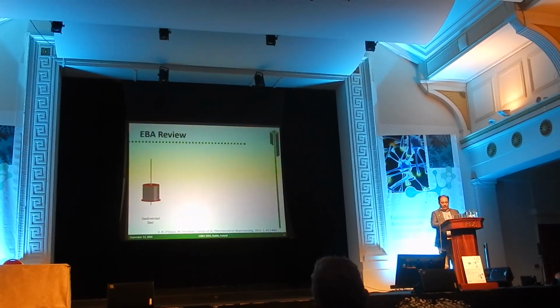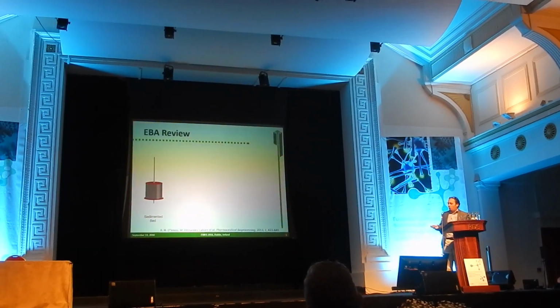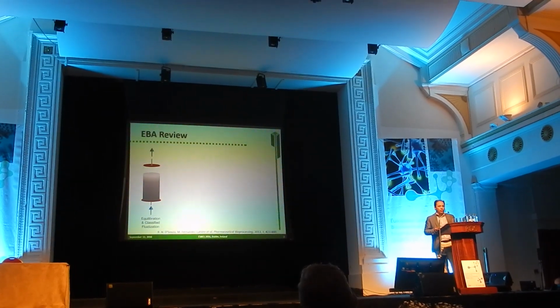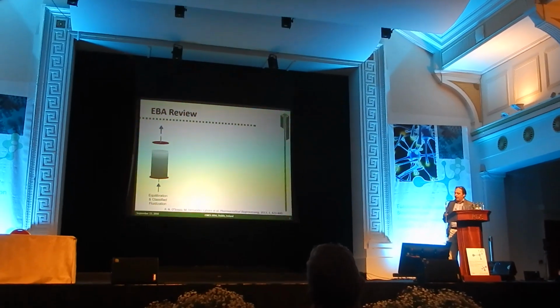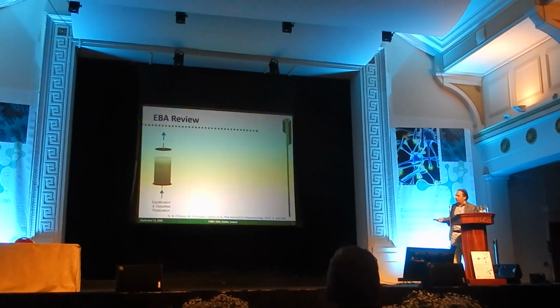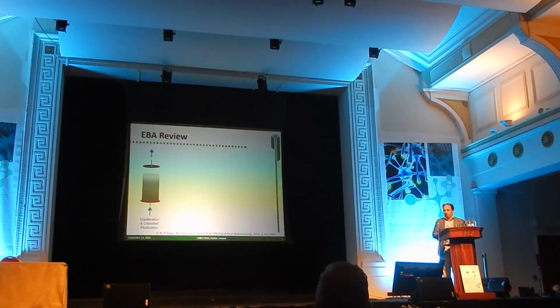In principle, this looks like a standard chromatography column. However, in expanded bed adsorption, we feed the column from the bottom, letting the material inside the column get fluidized. So de facto, we are creating a solid-liquid fluidization system, right?